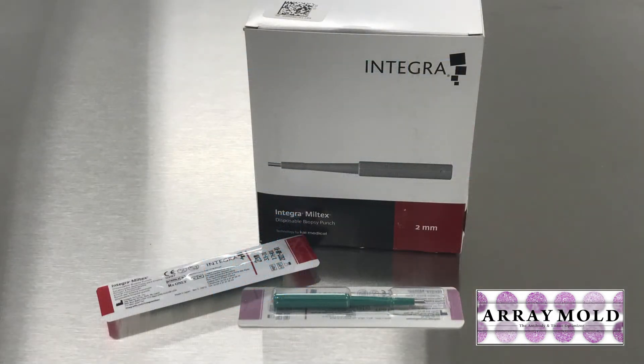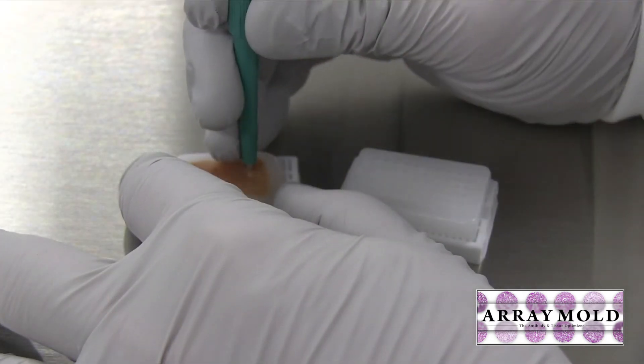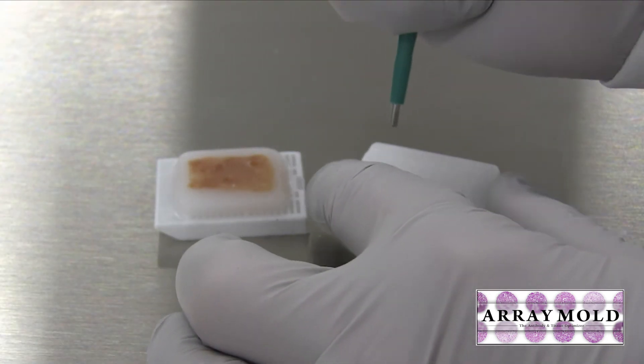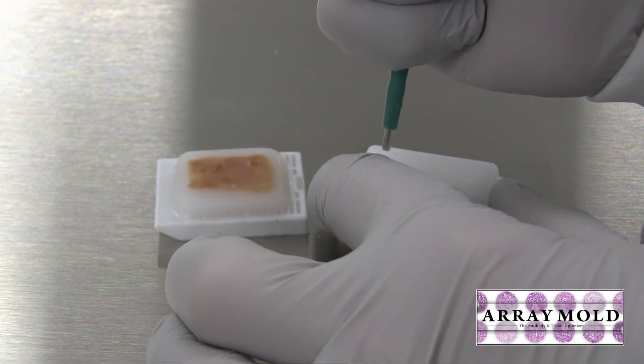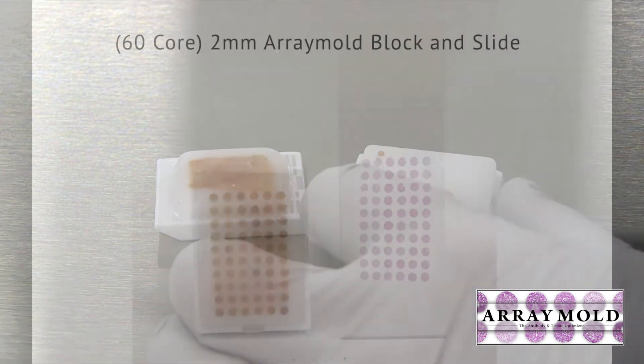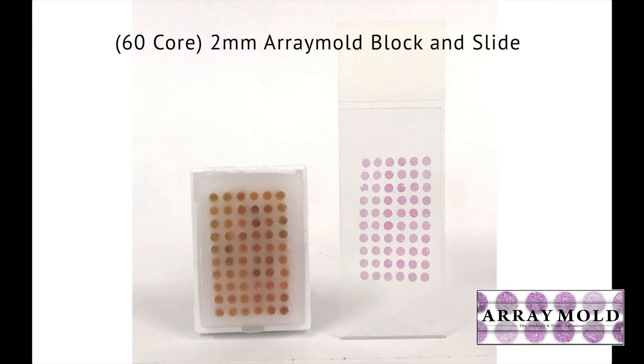Another reason why we went to the array mold instrument is because of speed. I can punch a 60-core TMA block in less than 15 minutes, whereas with the instrument on the left it took upwards of 45 minutes or more to punch a 60-core TMA block.